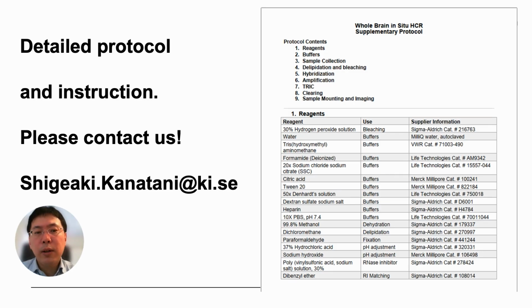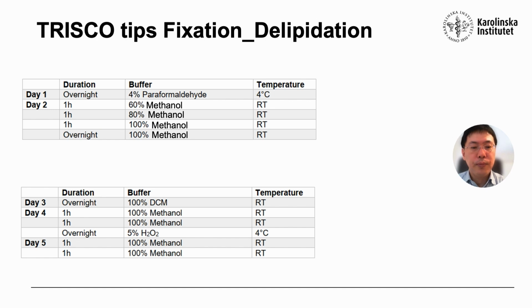Now, I'd like to walk you through the TRISCO protocol in detail. We are distributing a PDF file of the detailed TRISCO protocol, and in this presentation, I'll explain part of it. If you are interested in receiving it, please feel free to contact us. Okay, I'll show you the TRISCO protocol in detail starting from day 1.